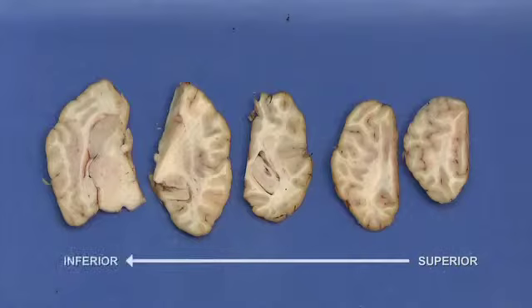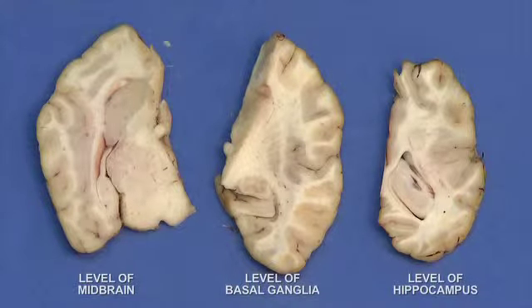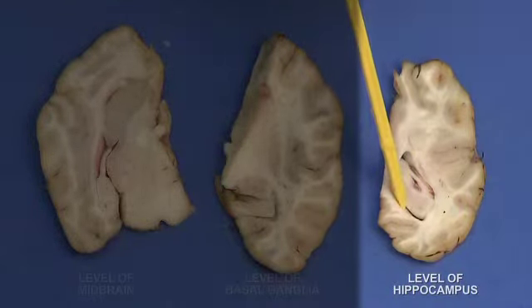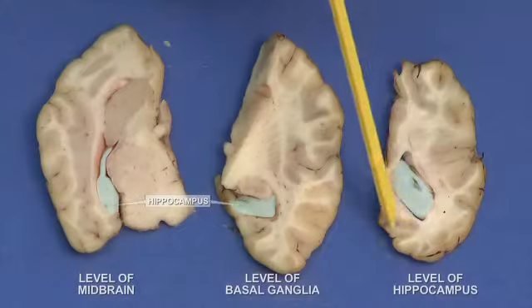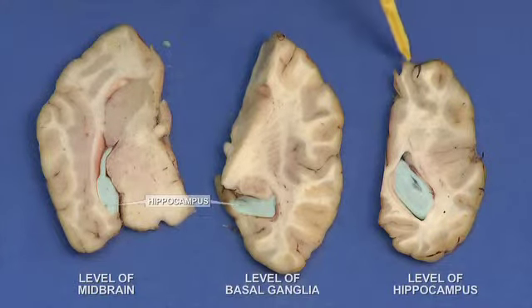So those are examples of horizontal sections. Some of the sections you can see are differently oriented for convenience of showing structures. With the first cut, we cut a large chunk of the cortex, and we are now exposing the level of the hippocampus. So this part here is actually the hippocampus, and the hippocampus is here in the lateral ventricle in the posterior limb. All surrounded here are the cerebral hemispheres, with the dorsal part and the ventral part here.